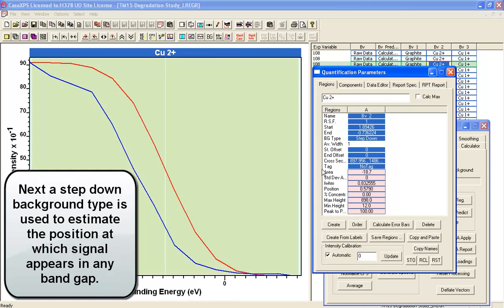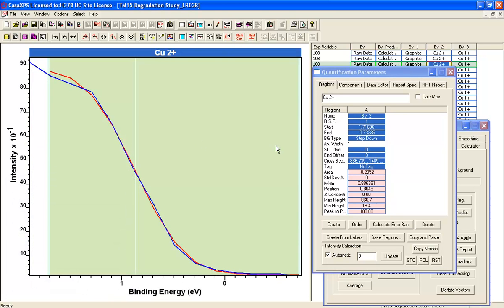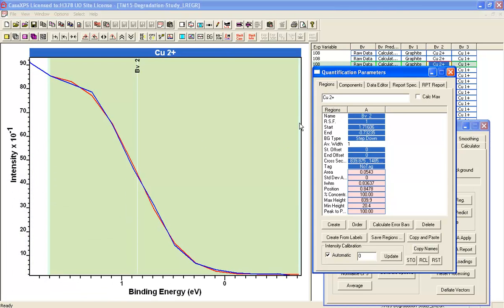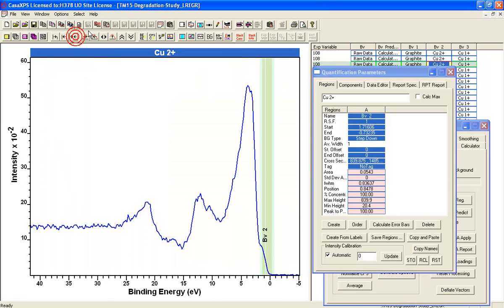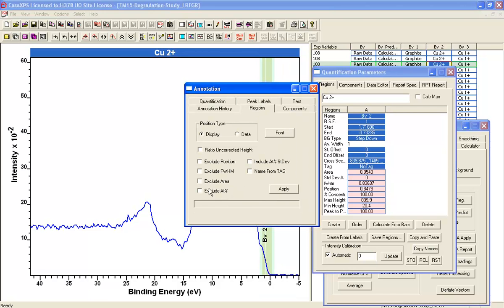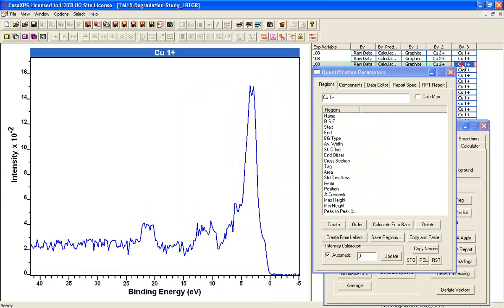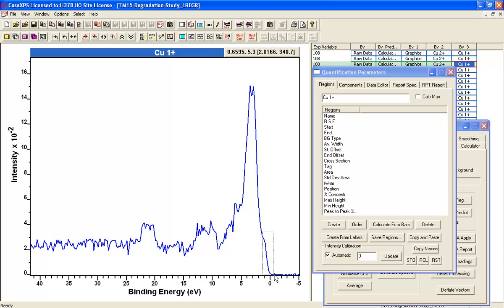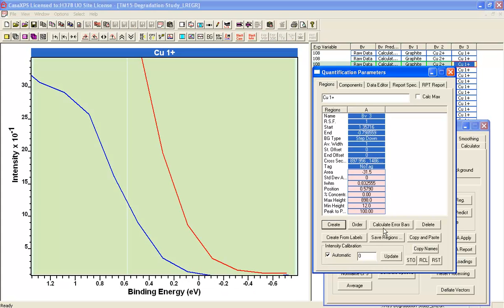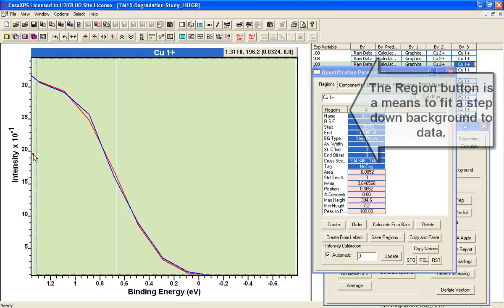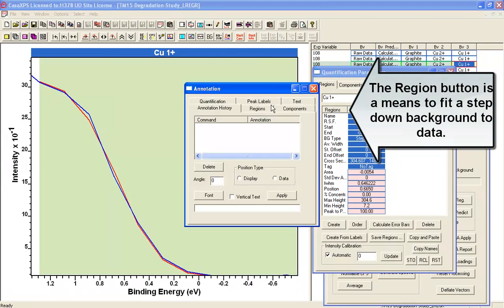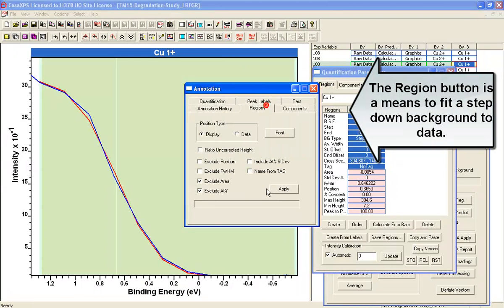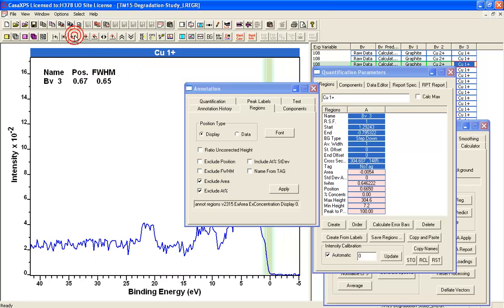The next thing we would like to do is try and understand what these might mean in terms of oxidation states. What we can do is use a step-down function to calculate the position of when intensity comes up from essentially a background of zero at the Fermi edge. Here we start to see signal from one of these at 0.85 and that's fitting a step-down function. We'll do the same with the second form of the valence band and that's 0.67 for the position.